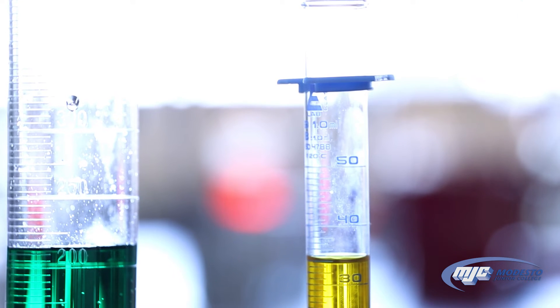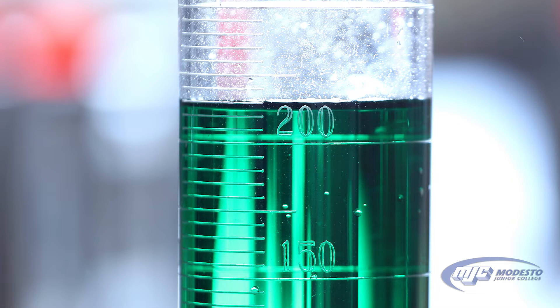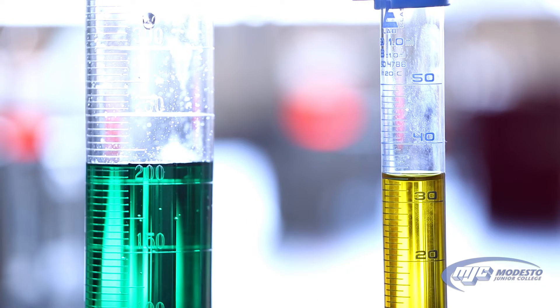When we're reading the volume in a graduated cylinder, we always read the bottom of the meniscus. You'll see when you look at the pictures here that there's a curve to the liquid inside of the cylinder, and we read the very bottom of that curve.